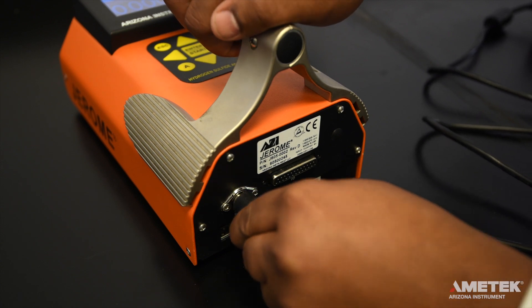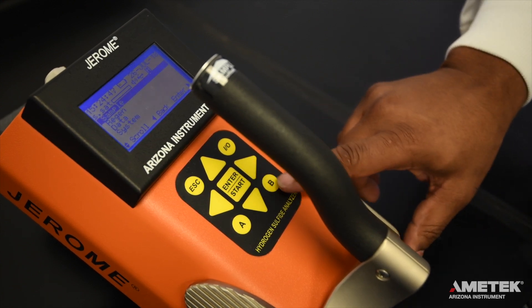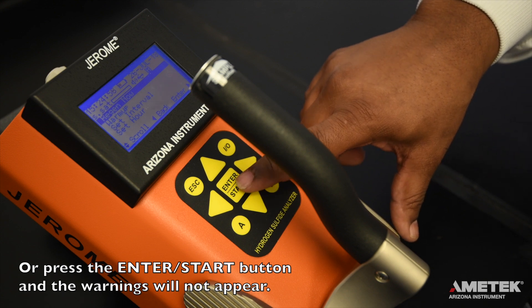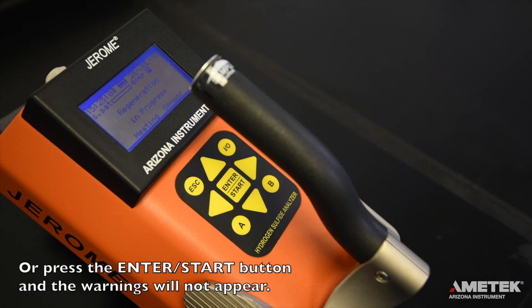To perform a regeneration cycle on the J605, plug the instrument into the line cord and AC adapter or the optional external battery pack. Press the right arrow button to enter the main menu. Then press the down arrow button to move the cursor to regen and press the right arrow key to enter the regeneration menu. Press the right arrow to select regen now on the regen menu. When prompted to confirm your choice, press enter to proceed or press escape to cancel. Read the warning that appears, then press enter to proceed or escape to cancel. A single regeneration cycle takes approximately 45 minutes, during which time you will not be able to use the instrument. Do not interrupt the regeneration cycle. If any error messages appear, refer to the troubleshooting section of the manual or contact Ametek Arizona Instrument or your local representative for assistance.